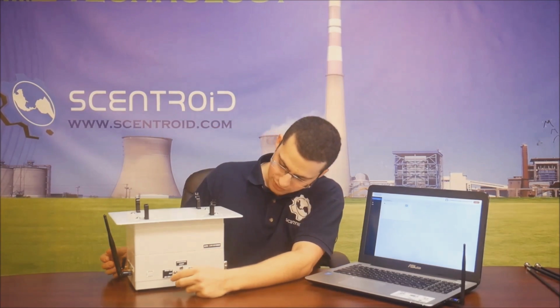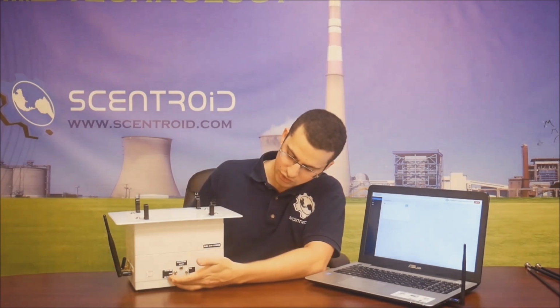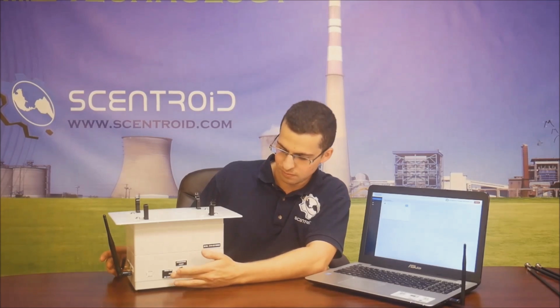The next thing I want to talk about is the switch position. The DR1000 has three forms of communication. It'll record data onto an SD card, onto our ground station, and to our cloud server. To decide which mode you'd like to record on, there's a switch here which says SD only or all forms of communication. You're going to want to select which form you want to send to by flipping it up or down.